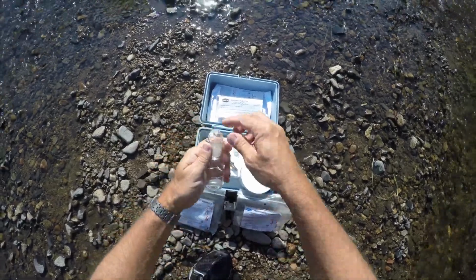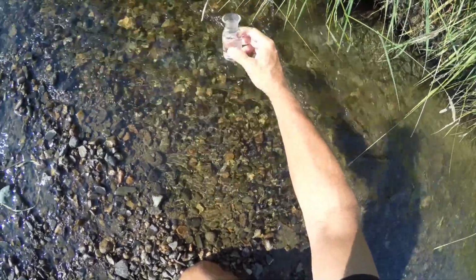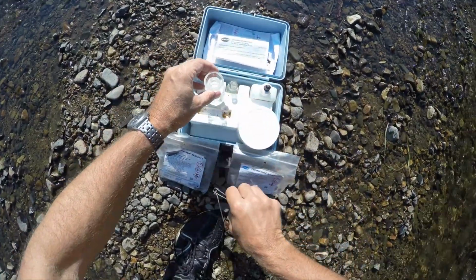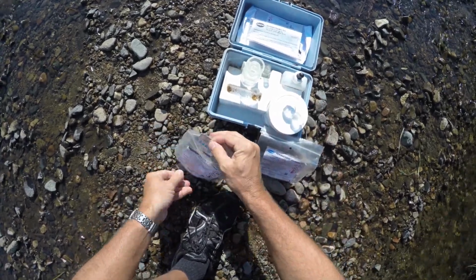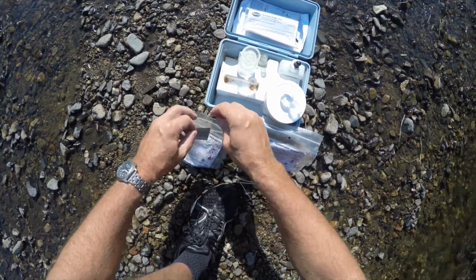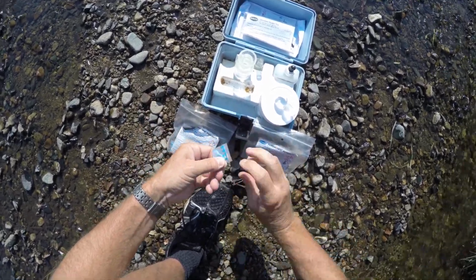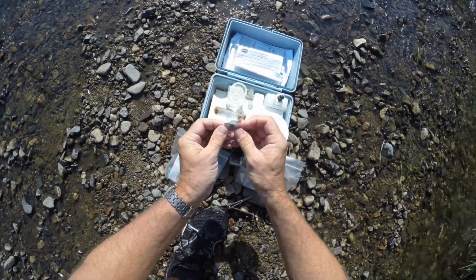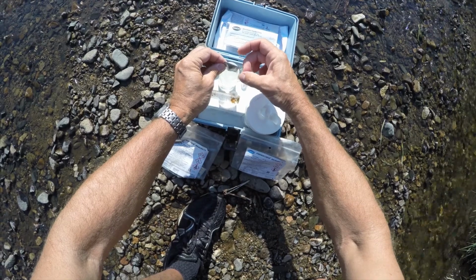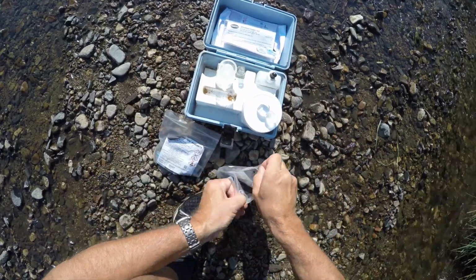All right, first thing we need to do, we need to get a water sample. Got my little flask here. Fill it up. Now we're going to add our dissolved oxygen reagent number 1. Give it a shake. Add number 2.